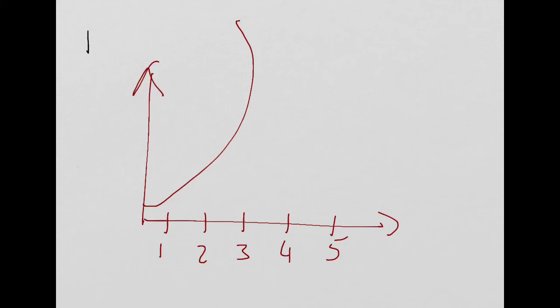And you think, did I really teach you? I mean, where have you been the last 3 years? Yeah? So, no, it has to be the concentration, not the tube numbers. Or the phone number of your girlfriend or something like that. Concentration. Okay? So this is what you have to do tomorrow. Not the tube numbers, but the concentration. And the straighter your line, the better it is. Can you do it? Go in peace.